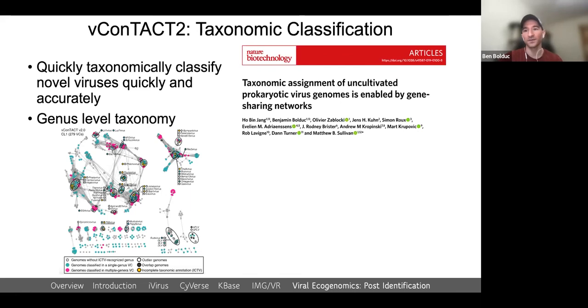There are a couple other tools out there that I don't really talk about here that do promote a higher accuracy, like 96, 97, 98, even in some cases 100%. But keep in mind, as a caveat, that those are known viruses. So if you have known viruses, next week, actually, I'll mention them.